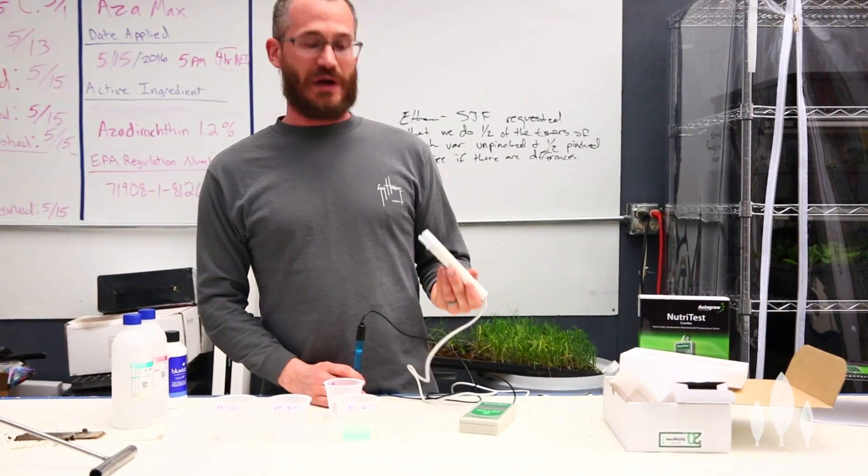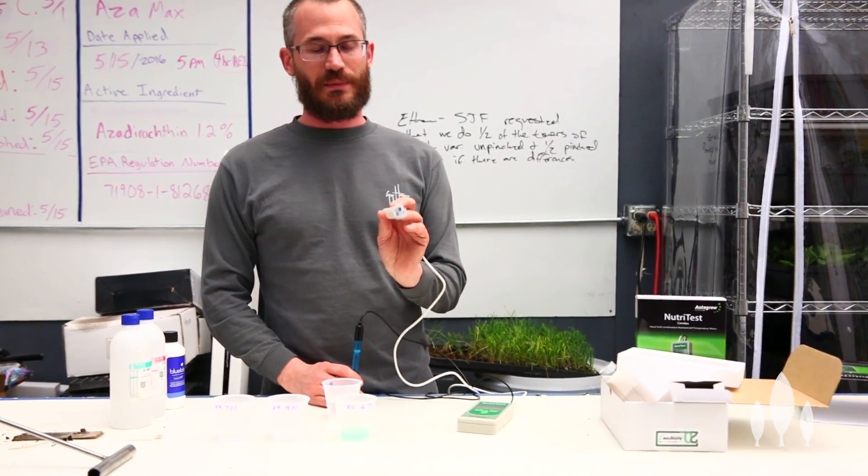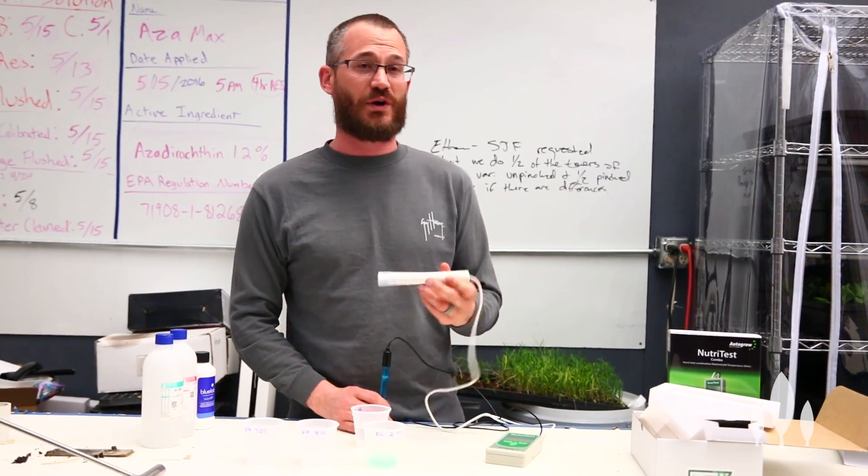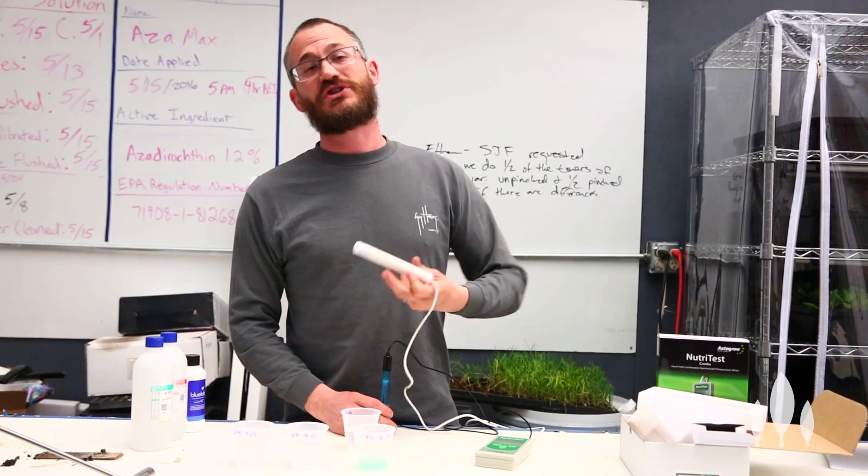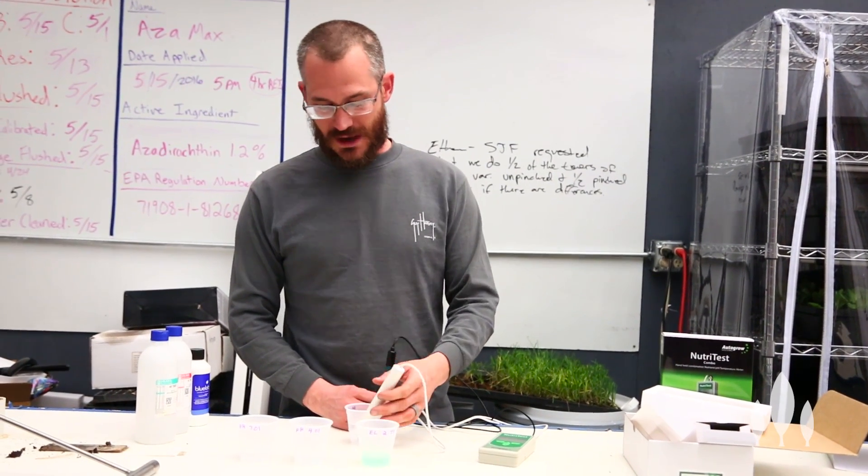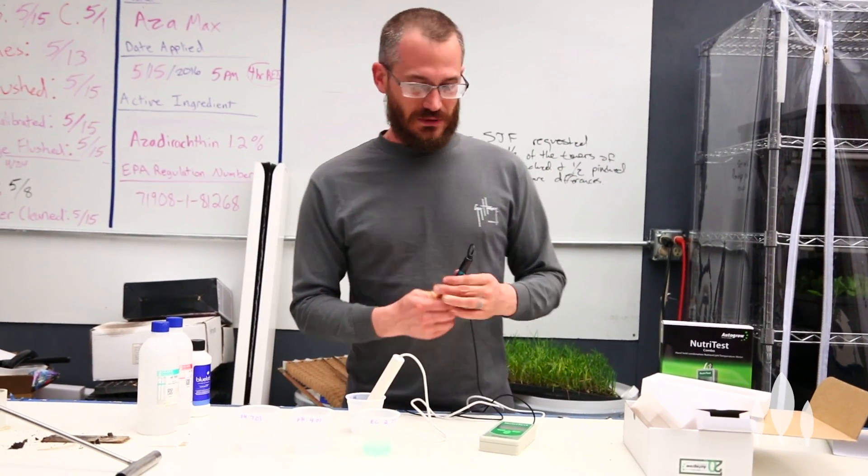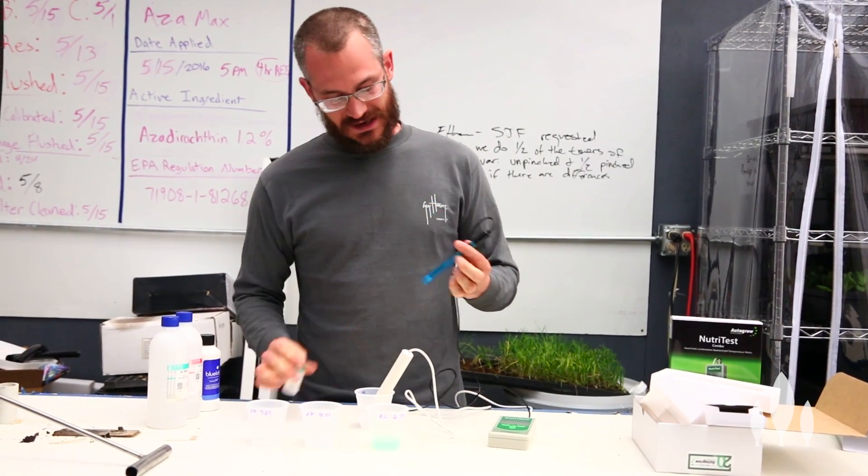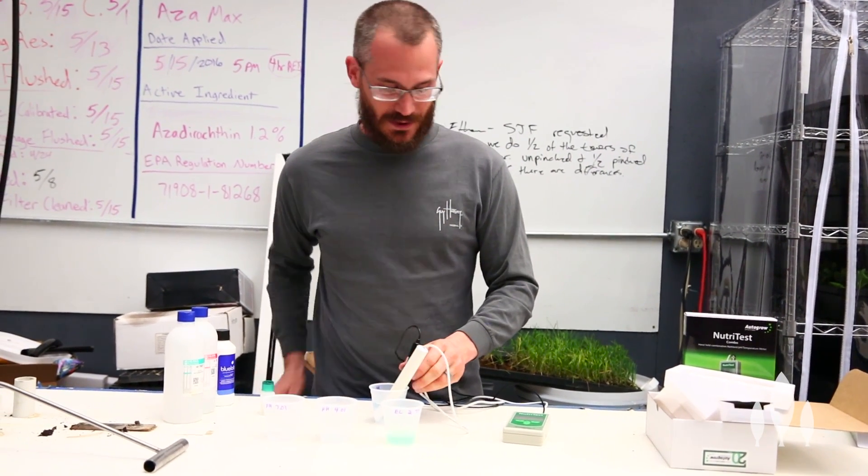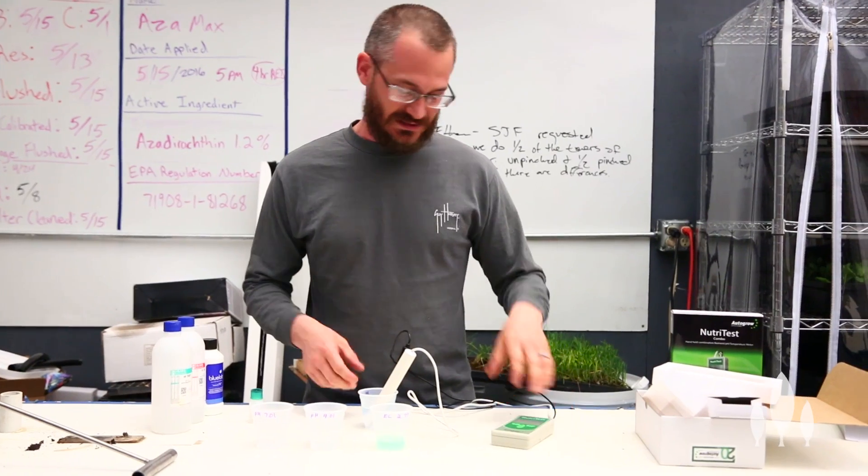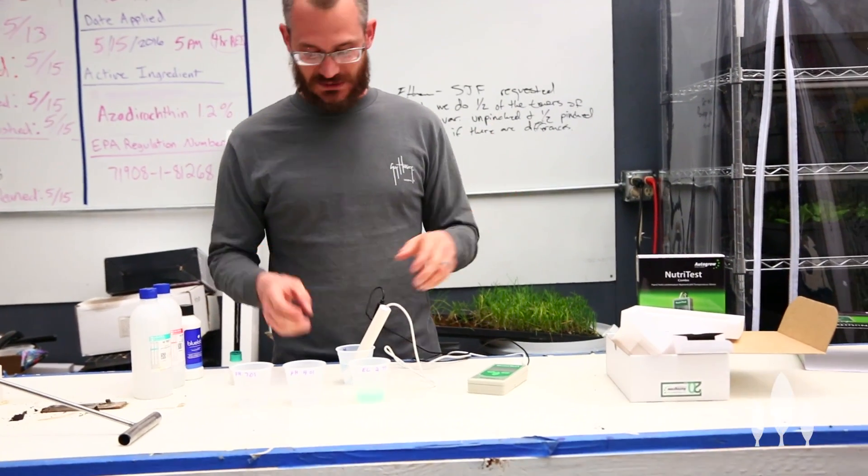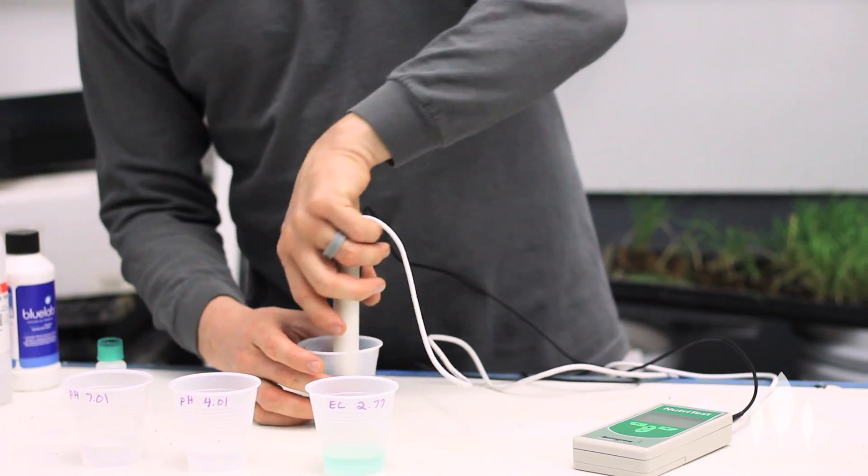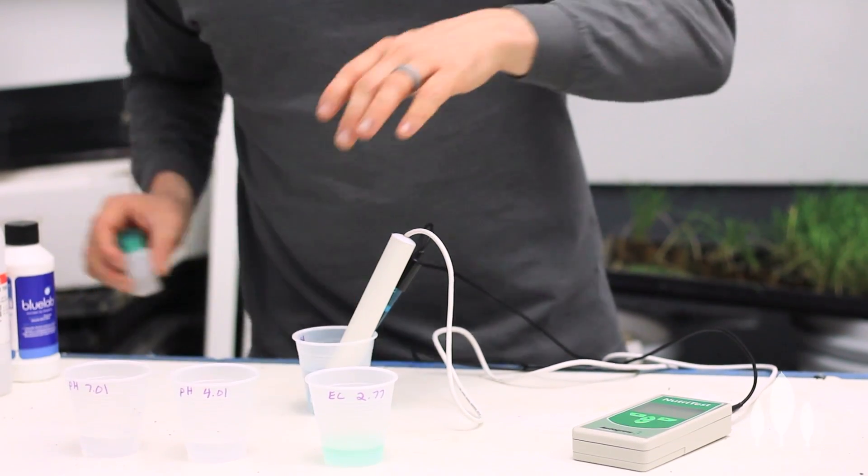The EC one, you can let it dry out. You know the EC one because it's usually a little bit thicker. It's got the two little black dots at the bottom. That's what's measuring the current through the water, or the amount of salts in the water, which gives us our EC reading. So, with these two probes, you basically plug them in, and like I said with the pH meter, you always want to keep it nice and just keep it moist. So I've got it in just a little cup of water for right now. So that's in a cup of water, very simple.